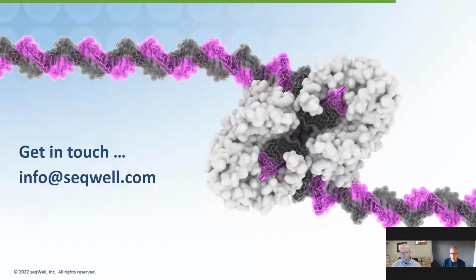Our first question here asks, how is seqWell's tagmentation technology different from others currently available?